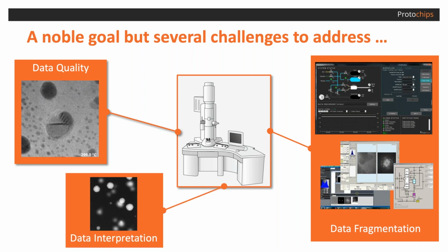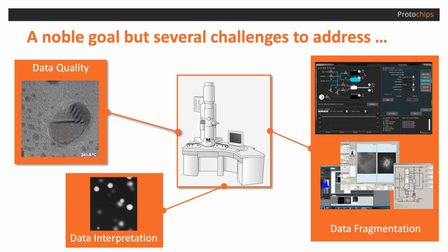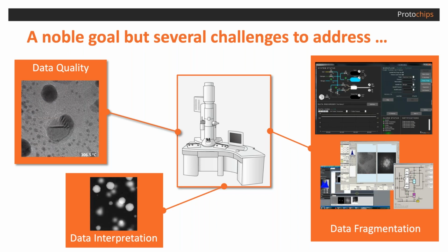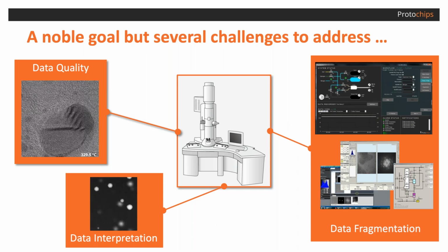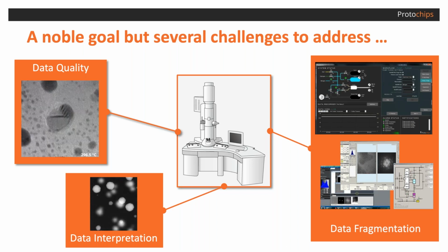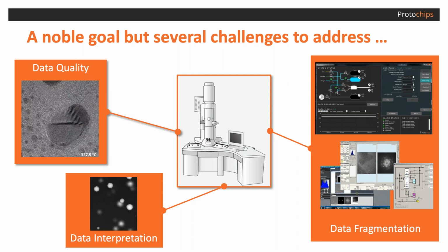And then the issue, of course, is when it is all over the place, it makes interpretation difficult. It's hard to determine cause and effect. If everything is synchronized together and those images are stabilized, things begin to jump out at you that might have gone unseen before. And we know that's a pretty critical thing to solve as well.